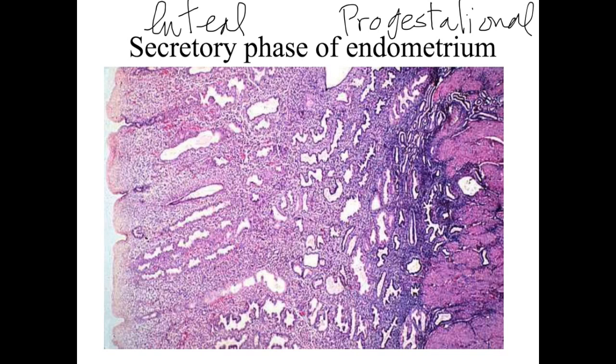Here the endometrial glands are long, very long. First thing, they are very long. Also highly tortuous. It is very important that they are highly tortuous, and this means they are full of secretion, denoting accumulation of the secretion, which is glycogen. Also, the thickness is so much increased.